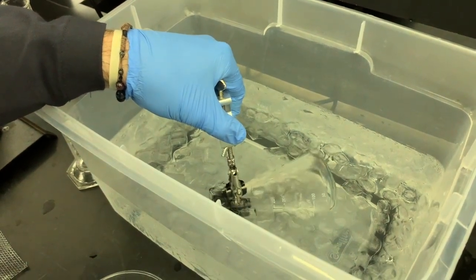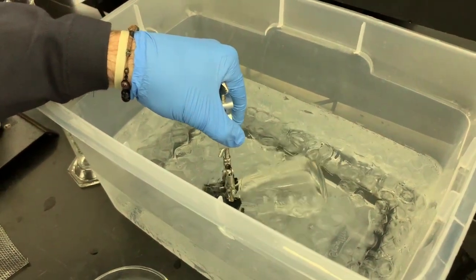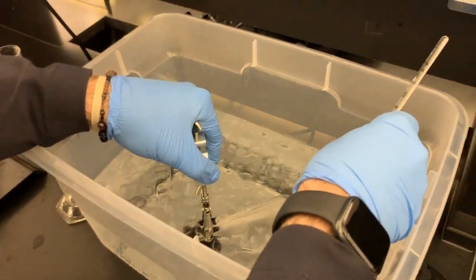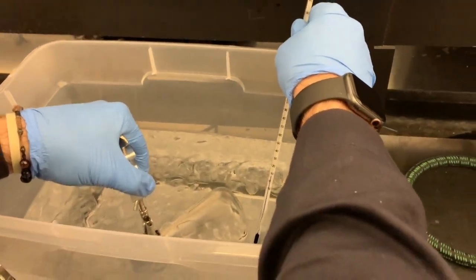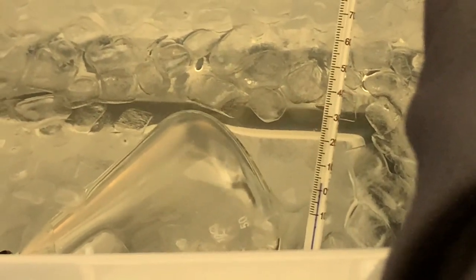So we're going to sit here and take a second to observe whether or not we're at the same temperature as before. Sitting at about 3 degrees Celsius.